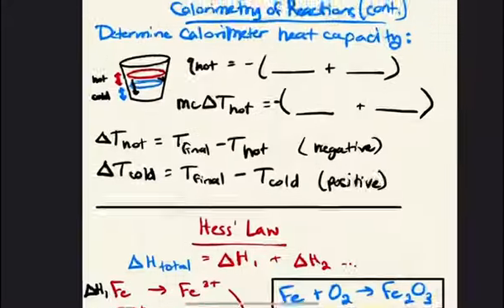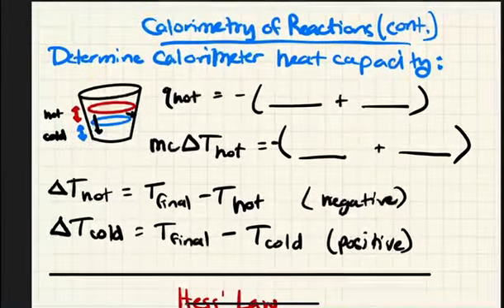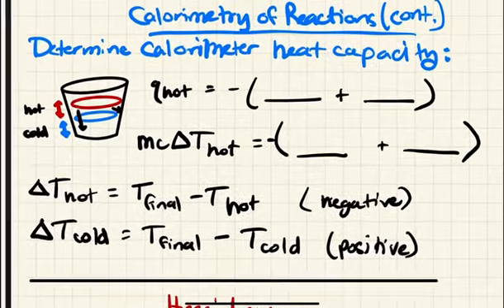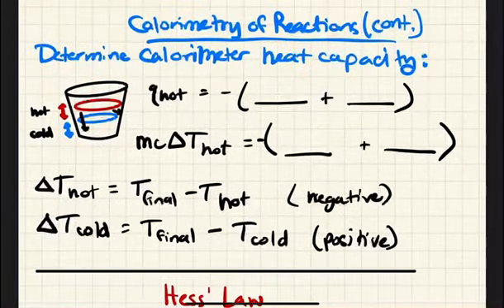Okay, so some important details before we're able to actually get to the point of measuring the heat of the reaction is that we need to be able to quantify that error involved in the coffee cup system. So we have a calibration step that we will go through first to get the heat capacity of our calorimeter. And no two coffee cups are the same. You have different masses of styrofoam, minor fluctuations in the processing and manufacturing of coffee cups. We will be double layering them, but also maybe some of the lids are not cut to the same size and so on. The hole for the thermometer is not perfect.